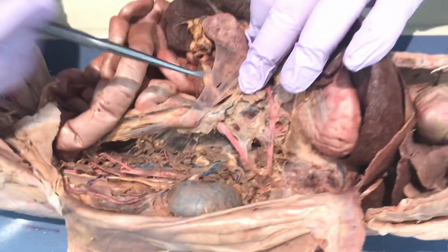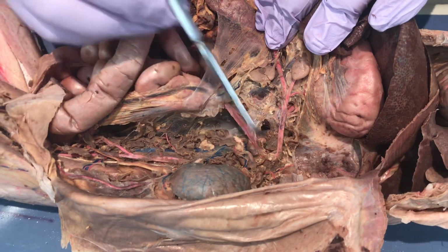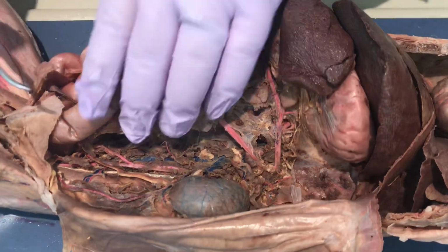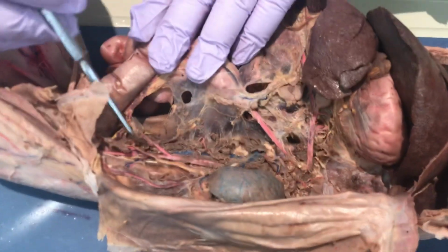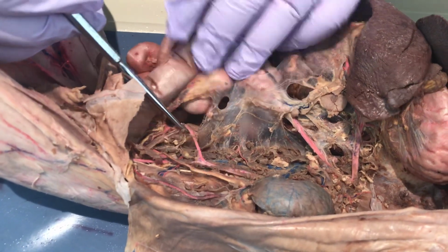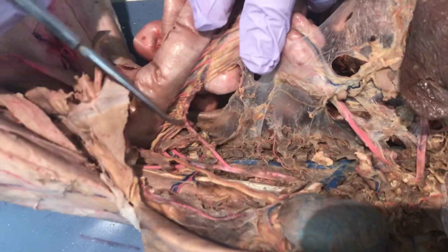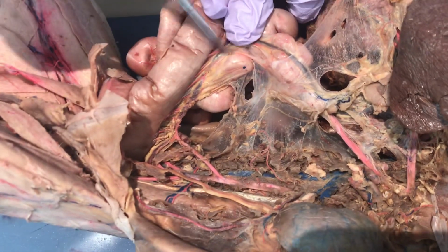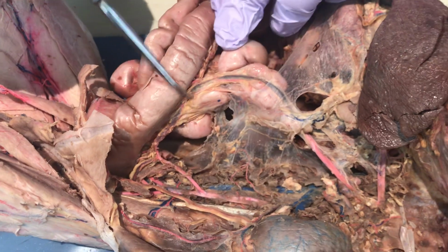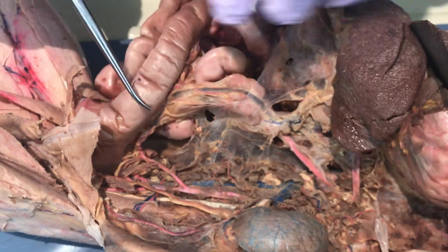The next one is the superior mesenteric artery. So we have celiac, superior mesenteric. And way down here is the inferior mesenteric. The inferior mesenteric branches into hemorrhoidal, going towards the colon, and this one up here is the colic artery. Colic artery will follow the colon and join back up with that superior mesenteric.